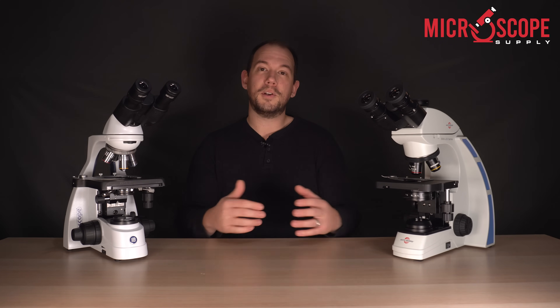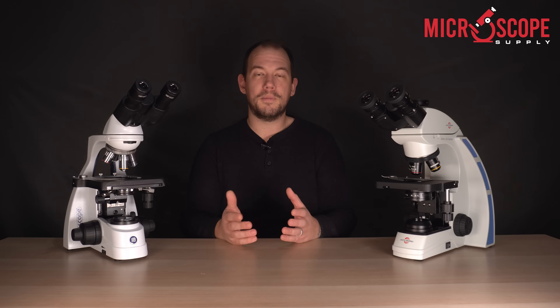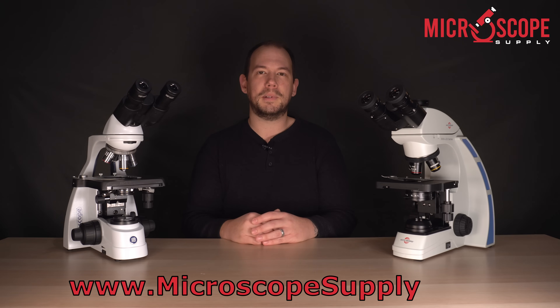So there you have it — five things to look for when purchasing a compound microscope. If you're looking for a new compound microscope, you can visit our website at microscopesupply.com. If you have questions, feel free to chat with us online or email us at sales@microscopesupply.com.